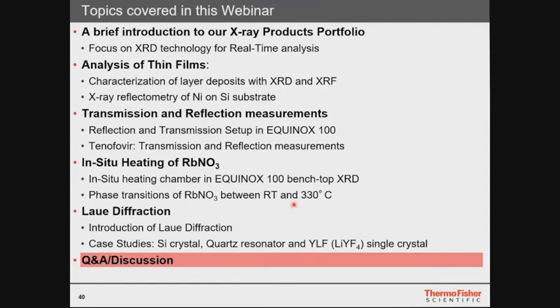Simon, next question is, if we increase exposure time, does it affect the XRD pattern? Yes, it does. There is a function which affects the signal to noise ratio. If you want to double your signal to noise ratio, you have to increase the measurement time by 4. So there is a square in it. Signal to noise ratio is just you get your noise band, which is maybe something like 100 counts, and you have a signal of maybe 1000 counts.